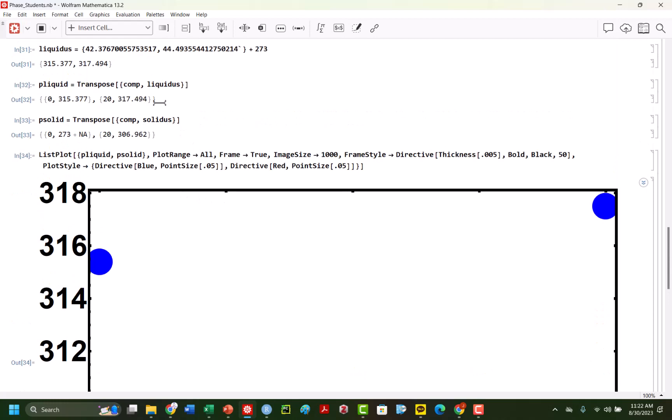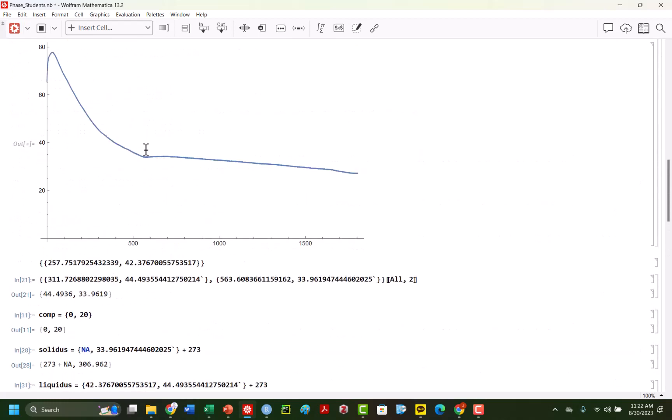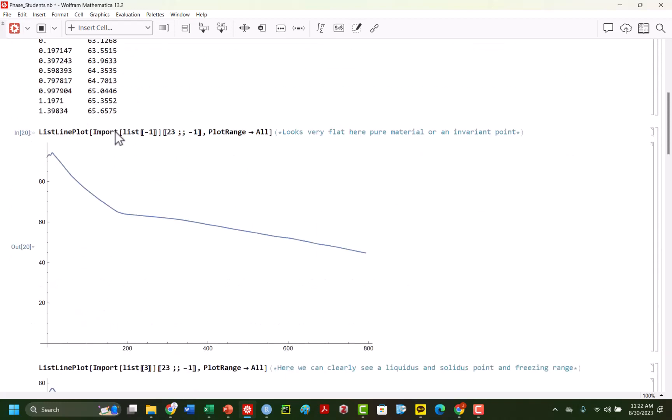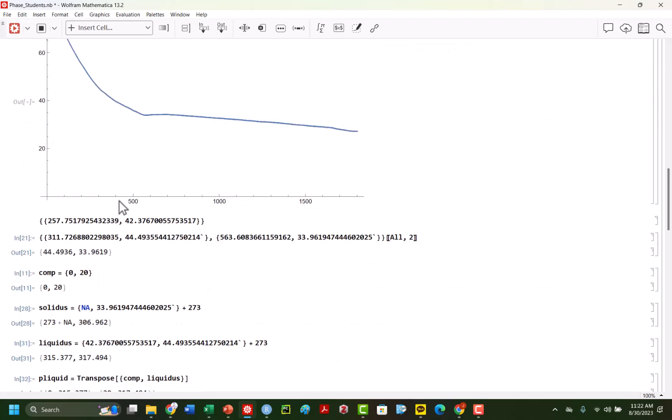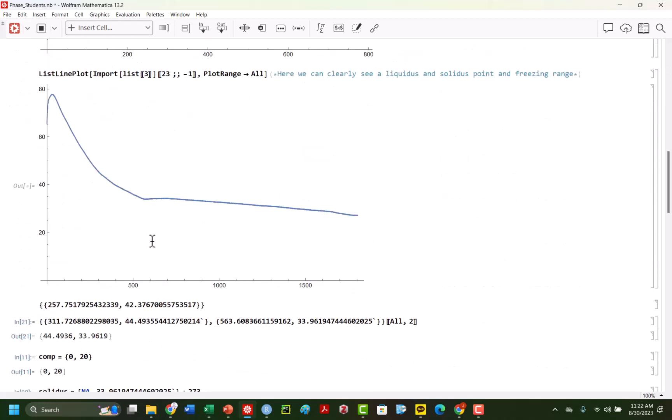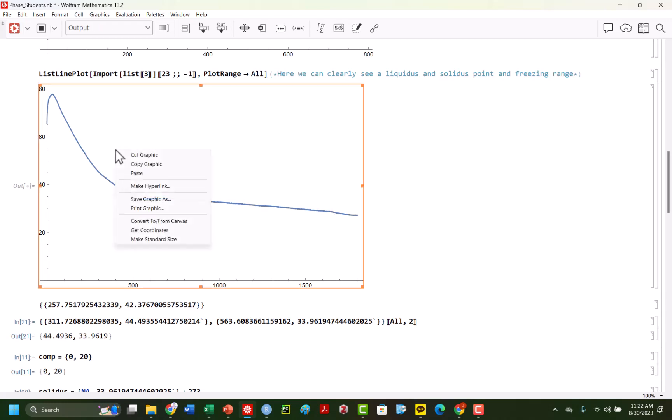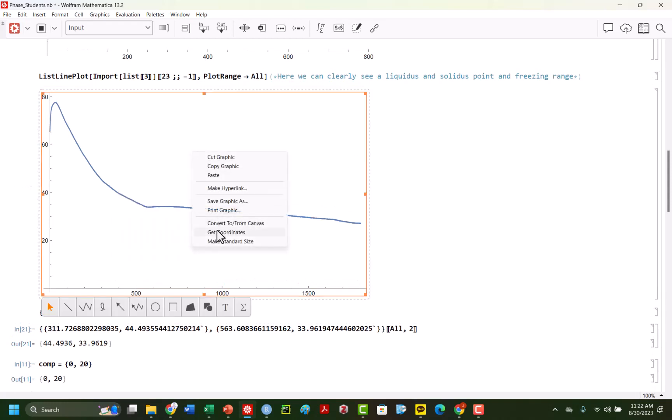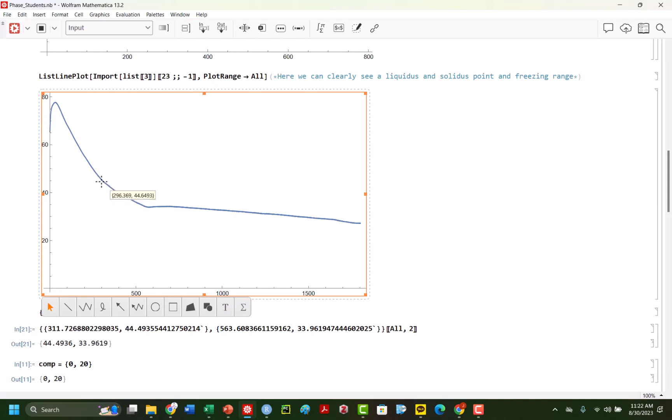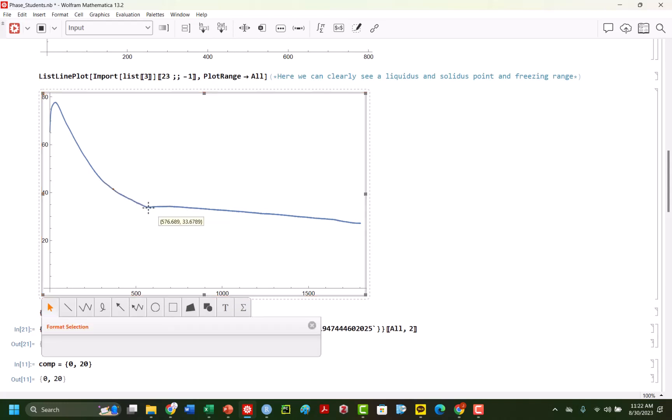Actually, I'm going to put this like that. Yeah, I guess we can, we can take a look at that in a little bit, actually. Let's, excuse me for a second. And then I'm going to just, let's take this. And I'm trying to look at, I think I clicked a little bit.